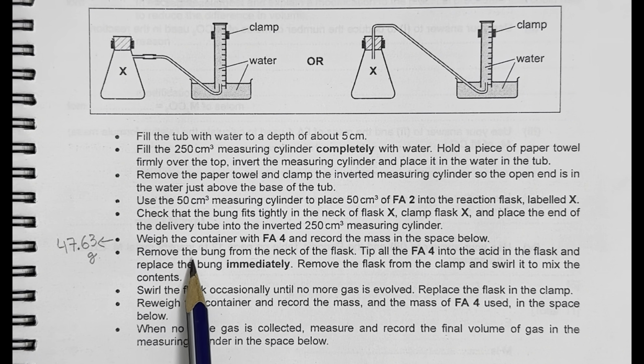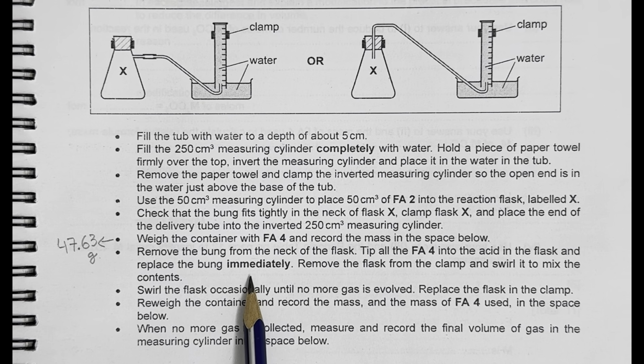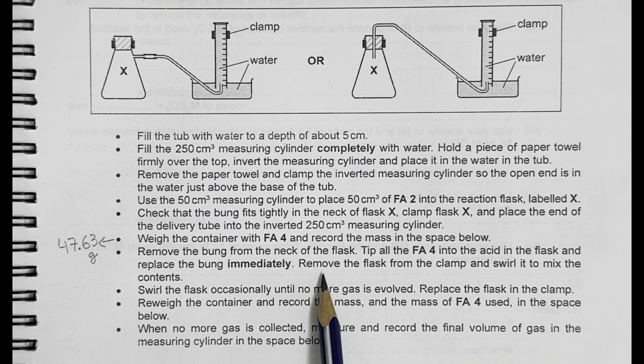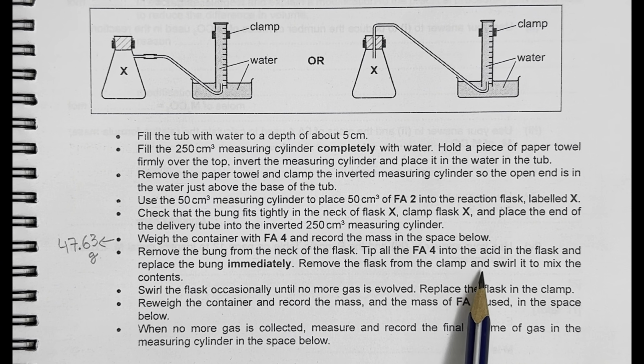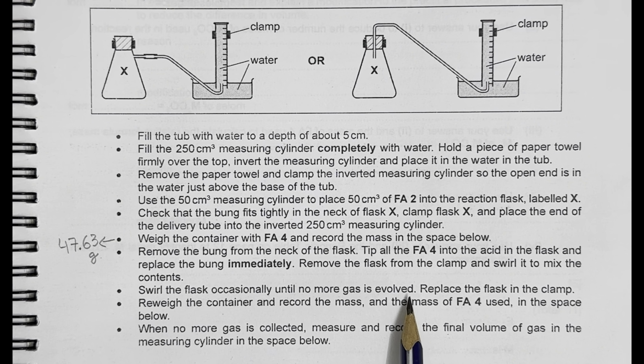Now, remove the bung from the neck of the flask, tip all the Fa4 into the acid in the flask and replace the bung immediately. Means there must be the least delay in time, or you can say the minimum loss of gas. Remove the flask from the clamp and swirl it to mix the contents. Swirl the flask occasionally until no more gas is evolved. Replace the flask in the clamp.